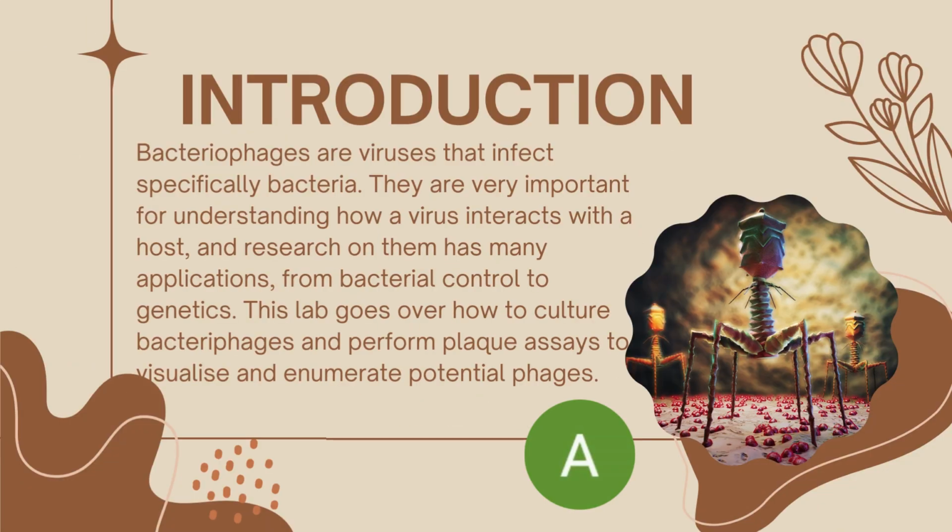To begin, bacteriophages are a subset of viruses that infect bacteria. These microorganisms provide insight into host infection mechanisms that enable applicable methods relating to bacterial control and genetics. This investigation focuses on culturing and identifying potential bacteriophages that may be applicable to future use.